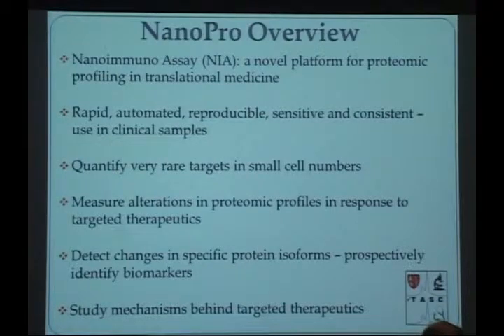Here you're really separating proteins based on charge, and that allows you for more manipulation, so for more data richness, because not only do you find the expression of a given protein that you're interested in, but you can also detect specific changes in protein isoforms, and that gives you just much, much more rich data to identify biomarkers that you're interested in, or to look at real-time changes in giving patients therapeutics, and Dr. Fan will talk more in detail about that.